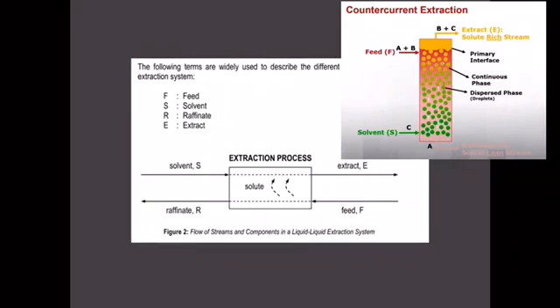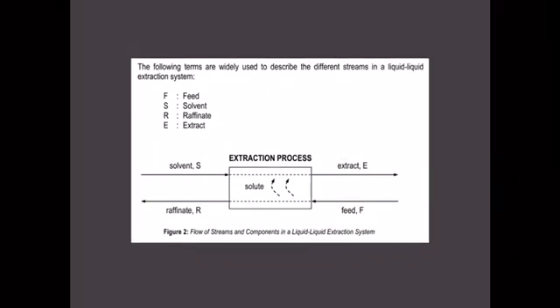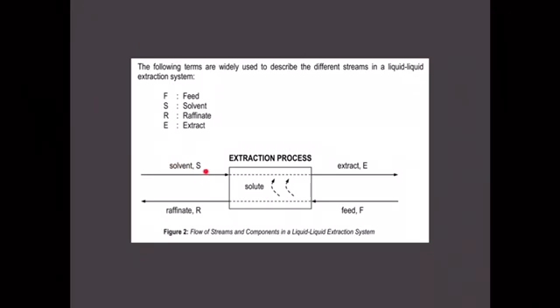In an extraction process, a quantity of feed liquid is mixed with a quantity of solvent.